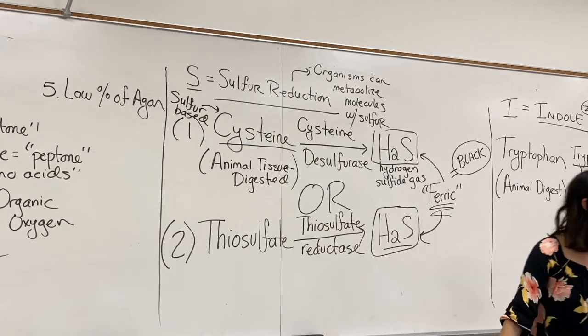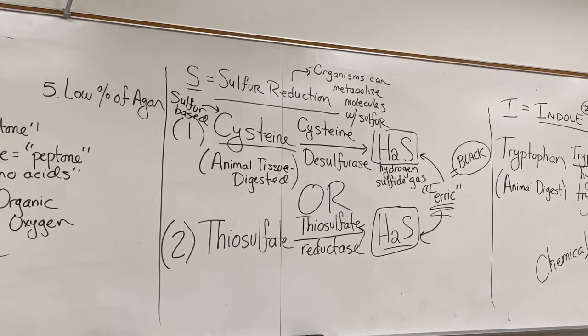For the indole, would it be a differential? Yeah, definitely. The indole will also definitely be a differential, because it labels the indole.